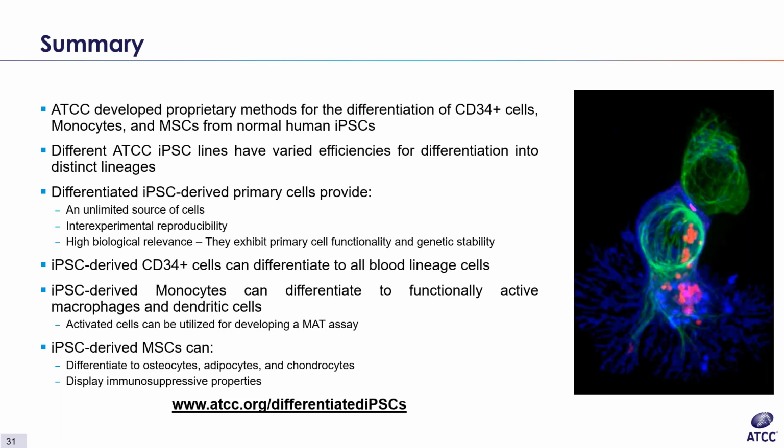The emergence of CD45 expression does correlate with a commitment to lympho-myeloid cell lineage. But what you see is once you have a higher proportion of cells expressing the marker, the cells overall have just gone too far along the path to differentiate to lymphoid type cells. So you kind of lose the myeloid differentiation capacity to turn into, say, erythrocytes or megakaryocytes.